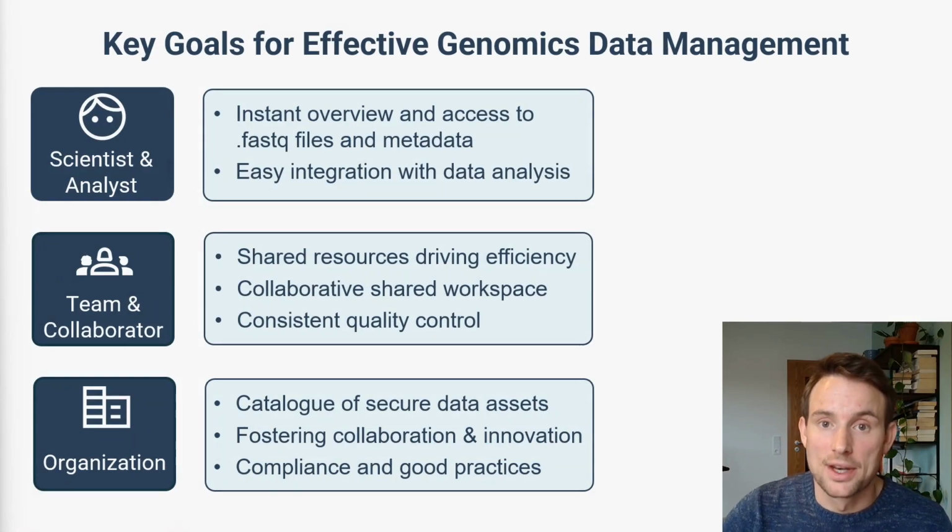Efficient management of NGS experiments is a key requirement for research organizations, as it greatly impacts productivity and the quality of the data. From different perspectives, scientists, for instance, need to have quick access and overview of available datasets. Data scientists need to be able to programmatically access databases that hold this information. Teams need to have a working environment where they can collaborate on individual datasets and the metadata that belong to these datasets and exchange datasets.